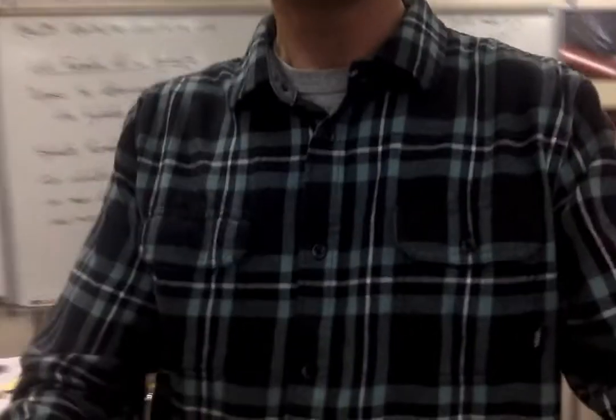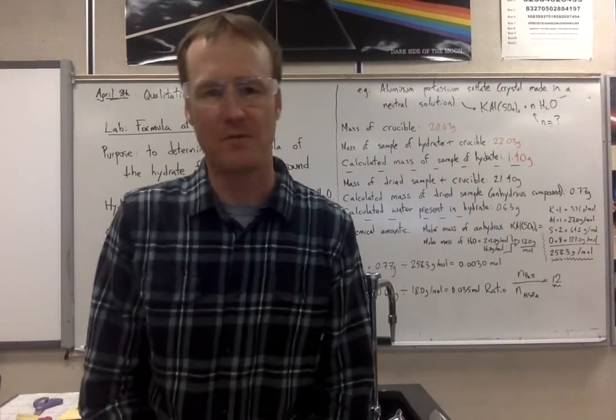Hydrate salts of transition metals are often very pretty and colorful.